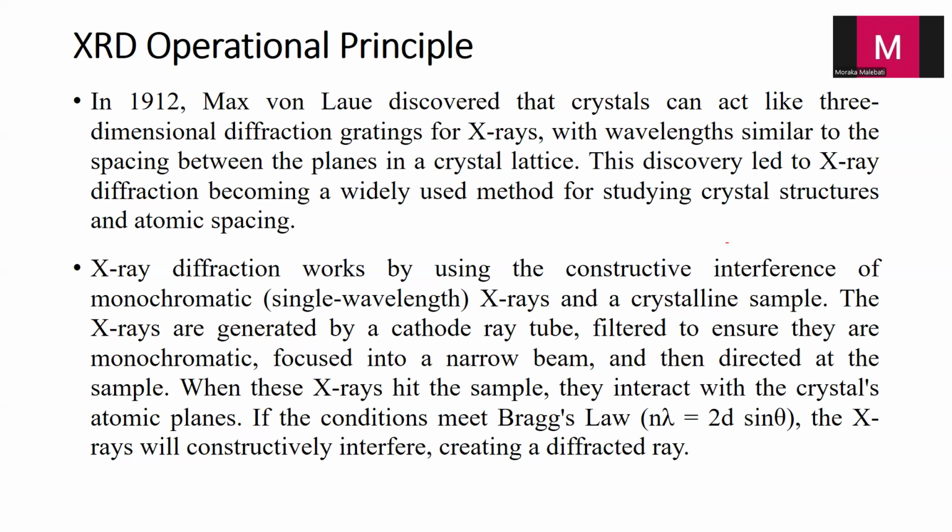I've already explained that the distance d is similar to the wavelength of the X-ray beam, and that distance d is the distance between the atomic planes. The discovery led to X-ray diffraction becoming a widely used method for studying crystal structures and atomic spacing, because of the understanding of the wavelength being similar to the spacing d.